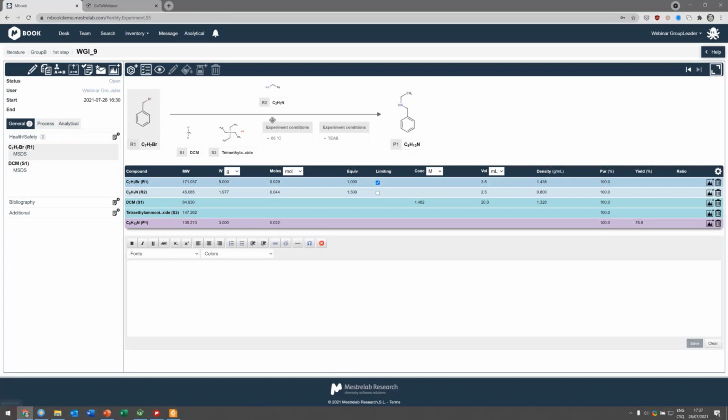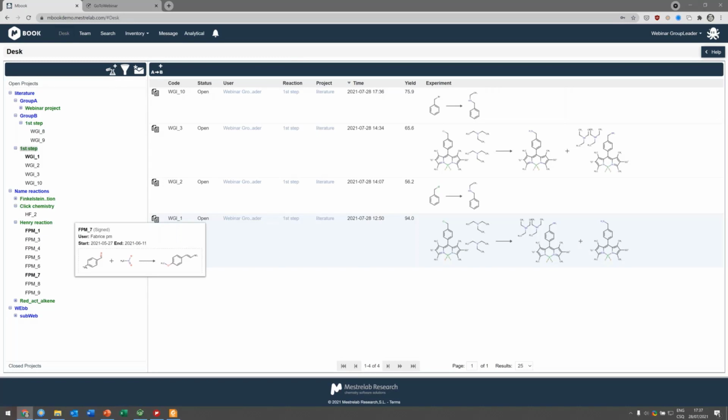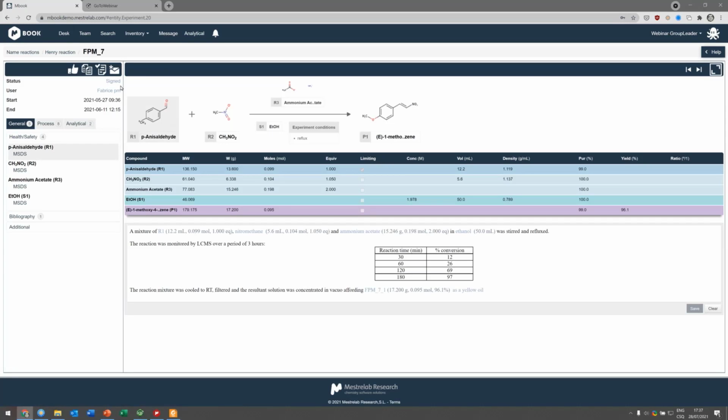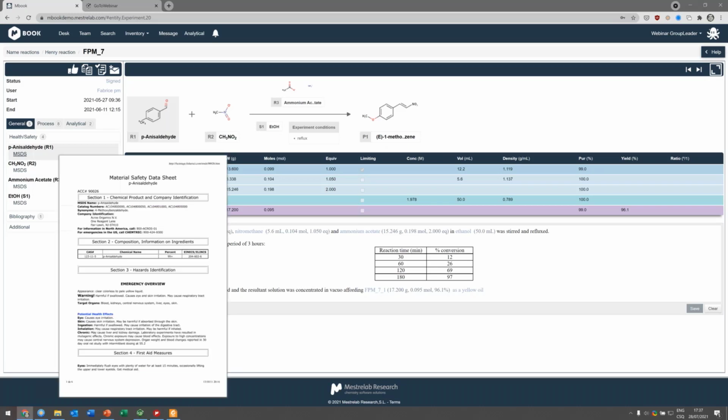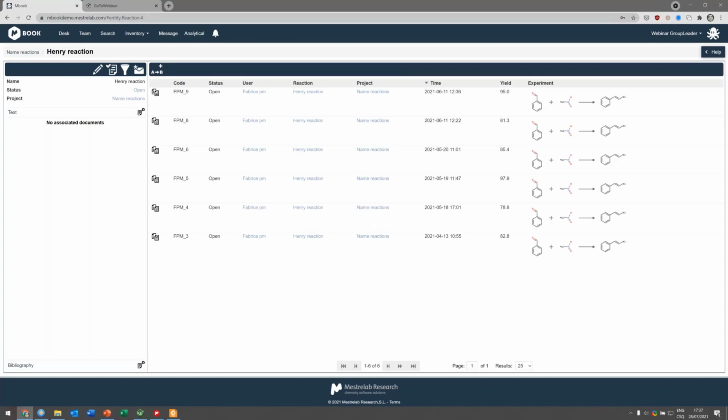Now, what I have not shown you is how to consume a source, but it would be pretty much the same. I just don't know which bottle I have right now. So let's take a look for something with a bottle. And I think this compound should have the bottle. Okay, I'm not sure, so I will not waste time on it.